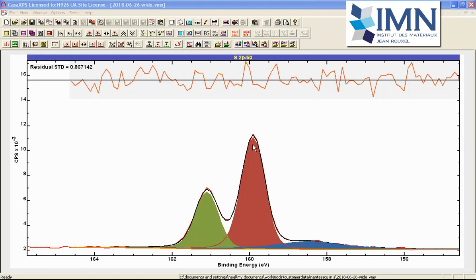The full width half maximum is also determined by the photoemission process itself. This sulfur 2p3/2 peak has a full width half maximum that is inherently narrower than this Gallium 3s peak. In theory, the position and the area of these component peaks should be independent of the acquisition conditions, but the full width half maximum is not. So it sits somewhere between the line shape used to fit these data and the position and area parameters.